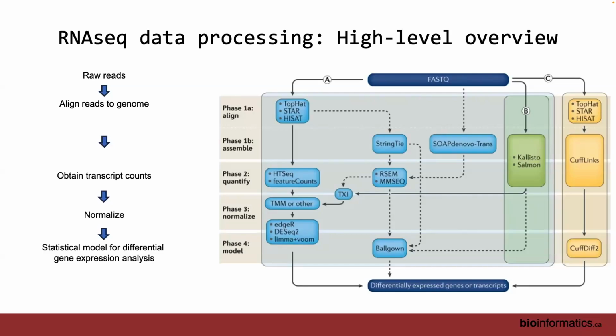Short follow-up to that then. I know I haven't really done anything with RNA-seq yet, but I've done a lot of stuff with Western blot, and with Western blot, oftentimes you're taking a housekeeping gene for a load control. And you're talking about how with RNA-seq, different sequences might get amplified differently just because of the inherent variation. Can you still take a housekeeping gene that you're not expecting much change in at these different developmental stages or these different conditions that you're looking at? Can you do something like that as well?